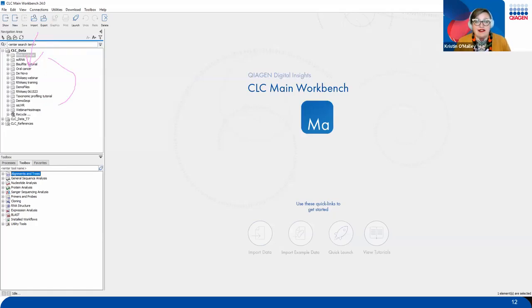So you can think of this as like Windows Explorer folders, just to keep things organized so you can quickly come back and sort through all of the different data that you've generated here. Now below that, we have our toolbox. This toolbox is going to contain a wealth of information. The first one that I do want to show you guys is this processes tab. When we click on that tab, you'll see here we have no processes shown.